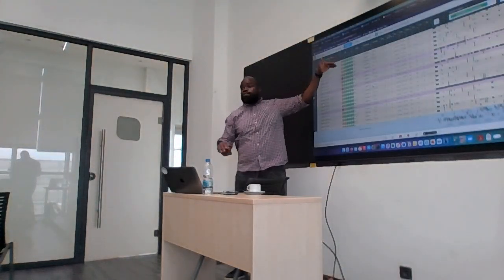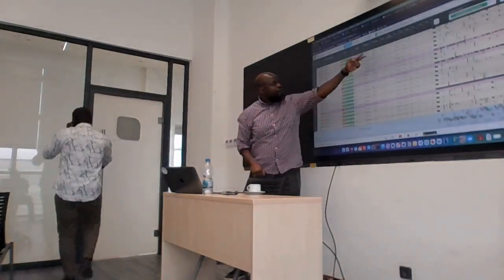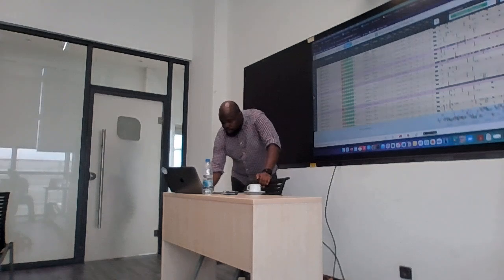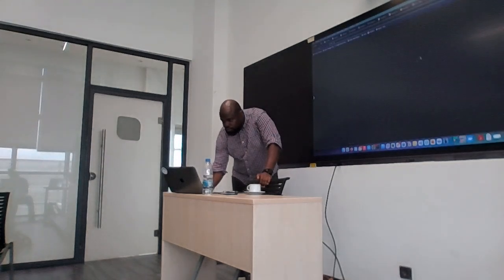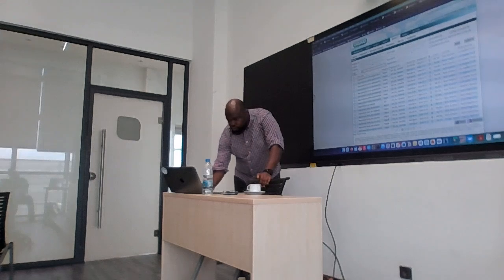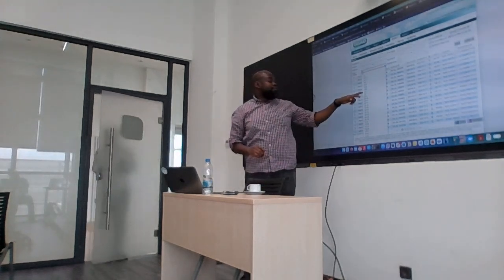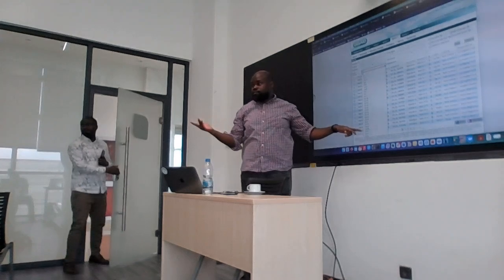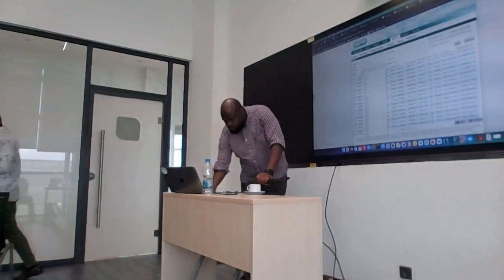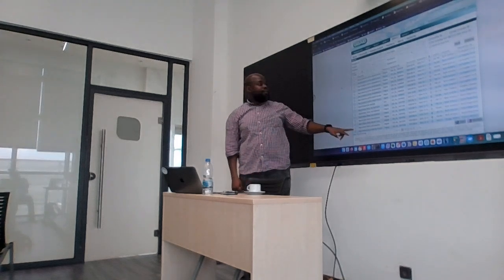So this is the consensus. You can see that they are all clade 2B, but they're different lineages, right? So ideally, if I could go to here and select clade 2B, but I can't choose all the B lineages at once. So I'll just select 2B. And you can see that we have 10,000 sequences there, right?